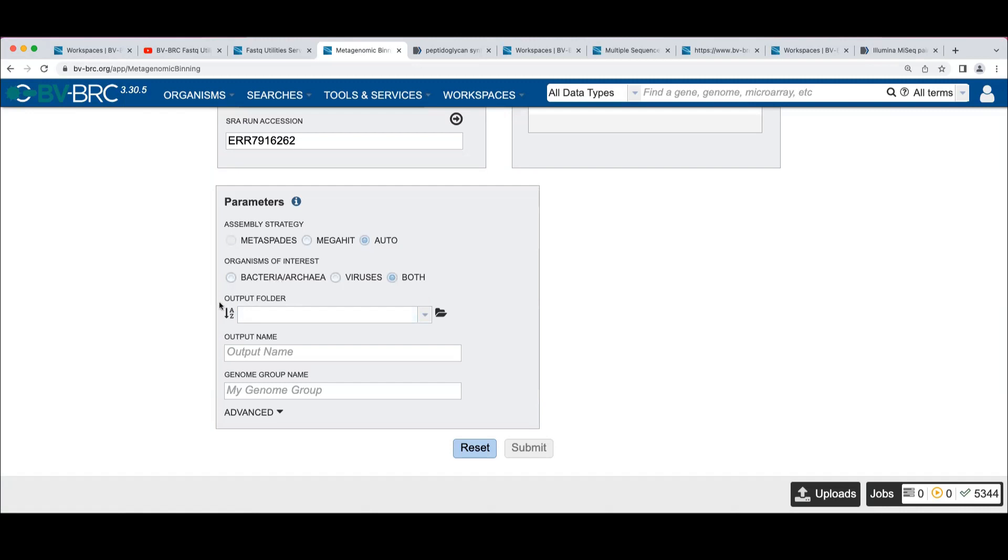You can choose here what you want to have done. We're going to leave this at both right now. But if you're actually interested in the viral content of things, it's interesting to run the binning both with binning the bacteria out first and not binning the bacteria out first.